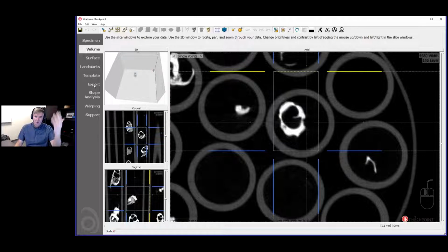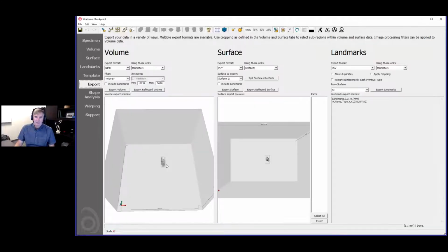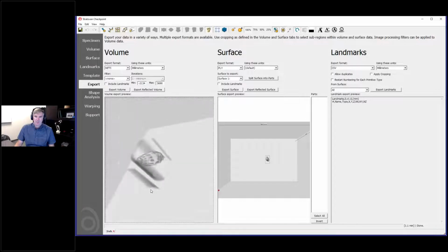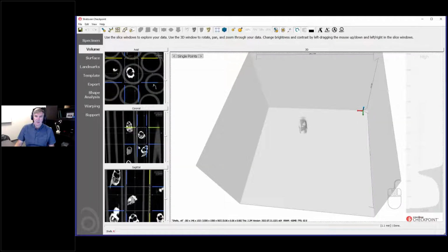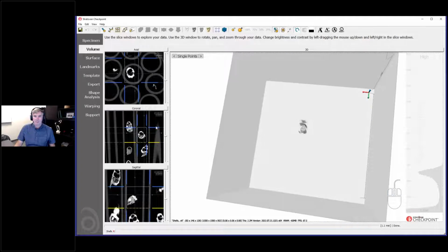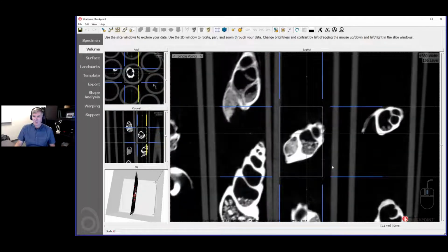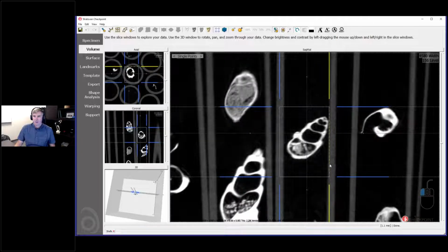export. So to do that, you go to the Export tab. So Export tab, and there's the little region that I can export. And so that's within the cropped region. And it looks like we got a little bit too much here. So let's go back. Let's see where that's coming from. Way up here. Yeah, so we bring this in here. Go back and check the view. Oh, yeah, there's still some. No, it looked like too much.